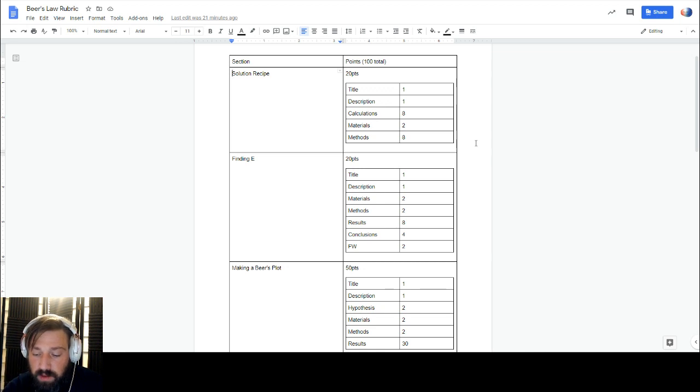Typically in a lab, you will have a recipe book, basically a standard procedure for making a solution, a copper sulfate solution, or all sorts of different buffers, TAE, TBE, all of these different things. You do need to write it down in your lab notebook, but the great thing is you only have to write it down once, and every time you refer to it, you can just refer back to it. You don't have to say, I made a new solution, and here's how I did it, every time. So you do have to write it down once though.